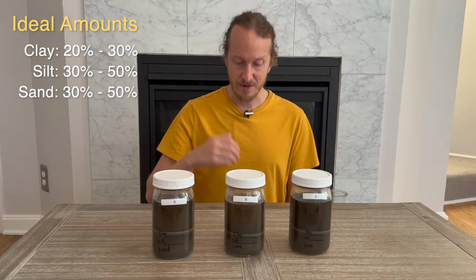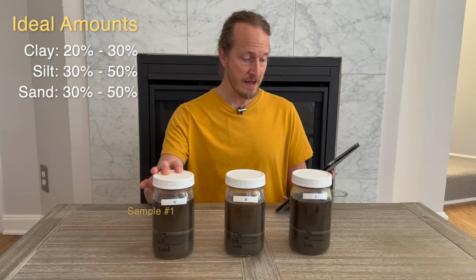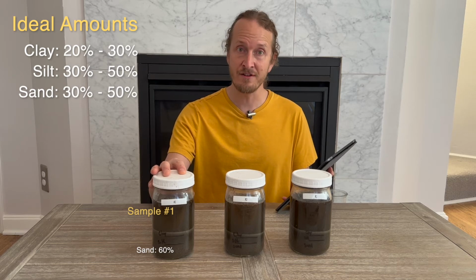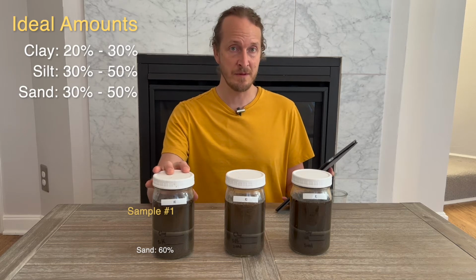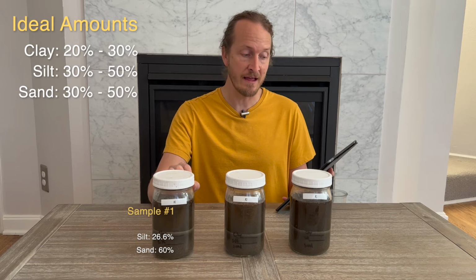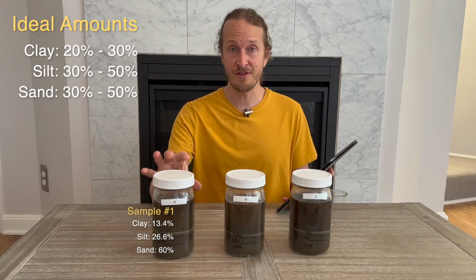Okay, so I have the measurements that we've taken recorded, and let's just go over each of the samples one by one. In our first sample, out of the 60 millimeters total, 36 millimeters were sand, and that comes to about 60%. So it's a little heavy on the sand. For silt, we had 16 millimeters. That comes to 26.6%, so a little bit low on the silt. And then only 8 millimeters of clay, which brings it to about 13.4%. So pretty low on the clay and heavy on the sand.